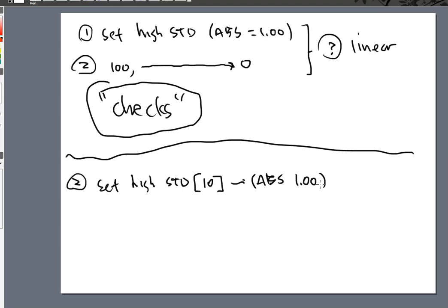So in a sense, I am making my detector not as sensitive, I guess, in a way, but really, truly, we are making it sensitive because it can see the 10 ppms, and it can do this job even better because it is scaling itself to the 1 absorbance with a 10 ppm solution.